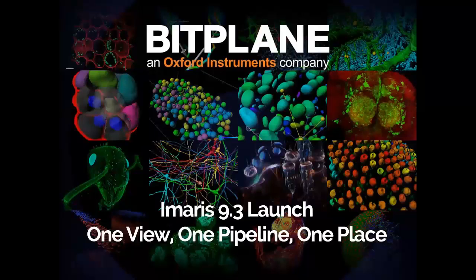Today, I want to tell you about Imaris 9.3. It's launching today, so if you're a current Imaris user, you can go and find it on the customer portal right now. But hang out with me before you go do that, please. You'll find more information on our website later today as well, and I'll talk about what sorts of resources you'll find at the end of the presentation.